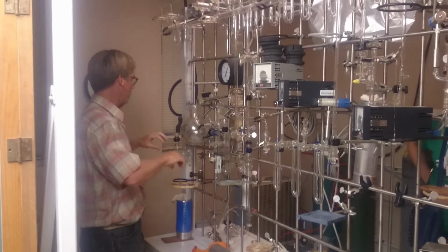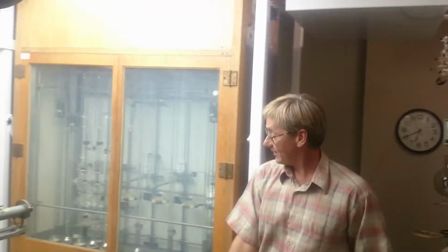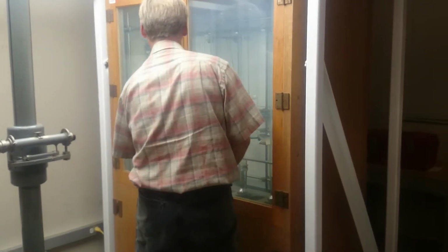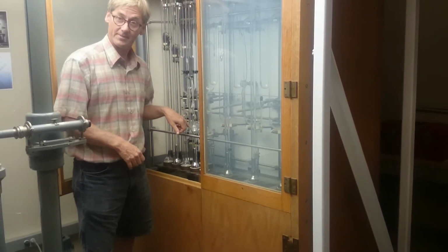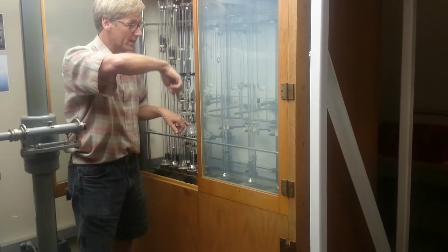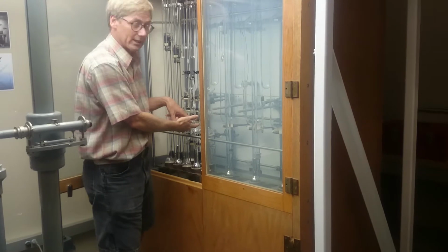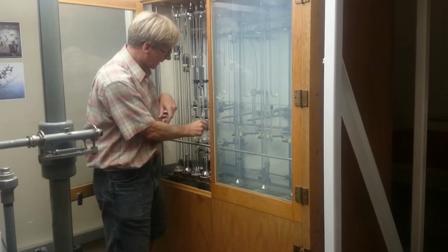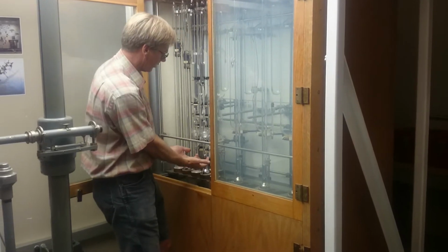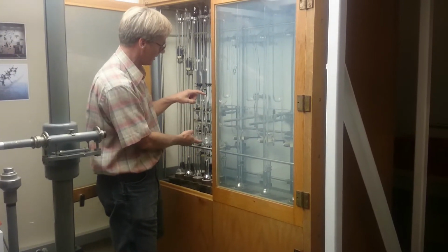You pump all the air away, you close this off, then you warm this up, and now you pour a little bit of liquid nitrogen in this little thing right here, and then you open up the connection back so that the CO2 would be self-pumped, or cryogenically trapped, pulled back over because it condensed out over here inside this tube. Then he pushed this mercury up to seal it off, and he would have captured the CO2 in this volume here.